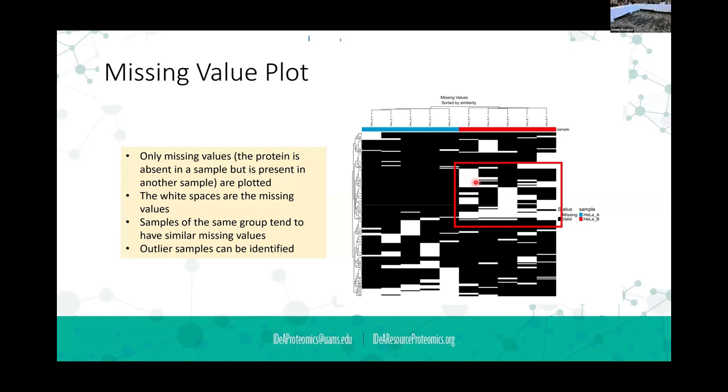There is, but there's not a hard and fast rule that we say any peak below this we're saying is not detected, because it depends on what the background is at that time. There are regions of a chromatogram where there just aren't many peptides, and because there's just not many peptides, you can actually see a very, very small signal.